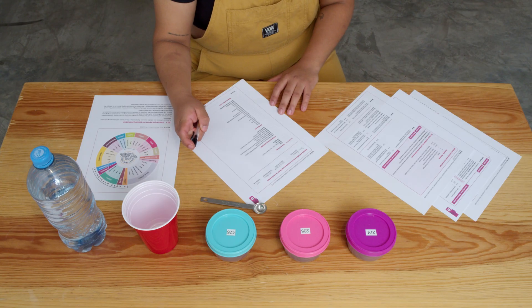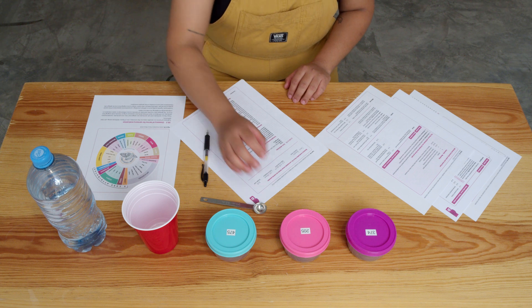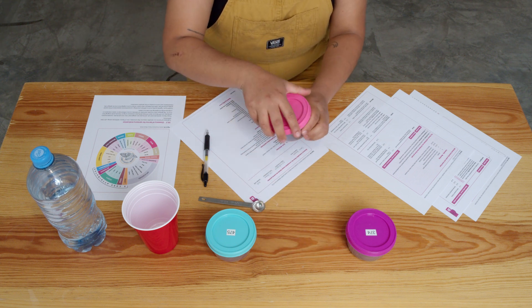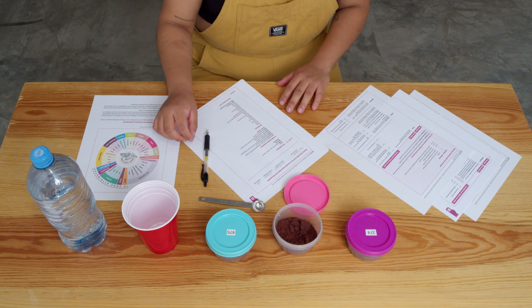Step 11: thoroughly rinse your palate with room temperature water. Step 12: one last time, revise your evaluation sheet and add any missing information or modifications. Step 13: proceed with the next sample or take a break if experiencing palate overload.